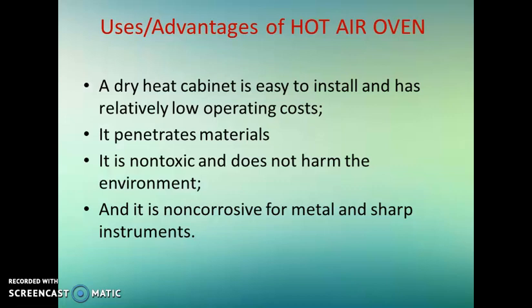Next is about the uses, or advantages, of the hot air oven. A dry heat cabinet is easy to install and has a relatively low operating cost.